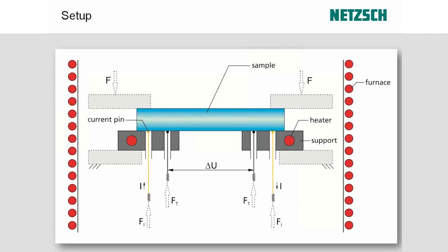And this measurement process that occurs is to heat the sample on the support in the furnace until we reach a stable temperature. So we have to wait for temperature stabilization, and then we start our measurement process. We measure first the electrical conductivity, then we measure the Seebeck coefficient, and then we heat up to the next step, for an arbitrary number of temperature steps, which we can program.